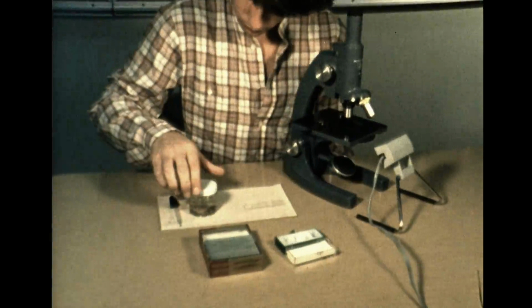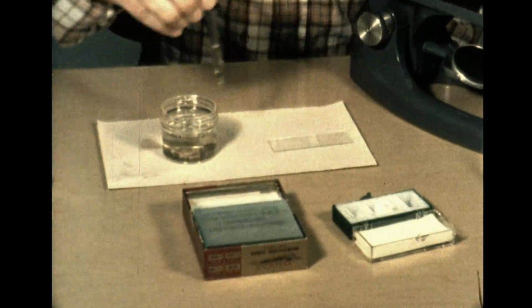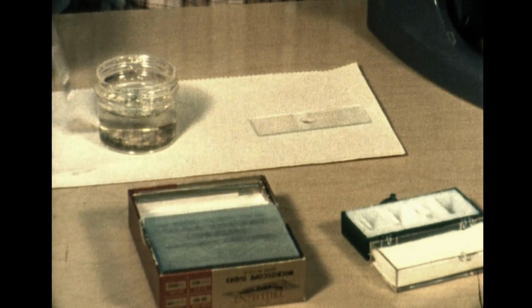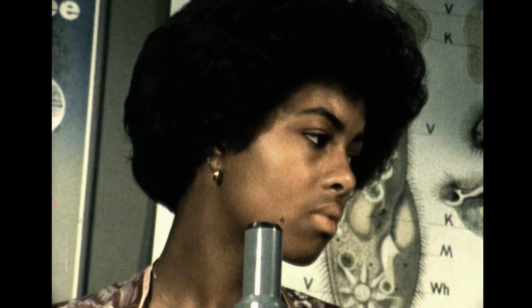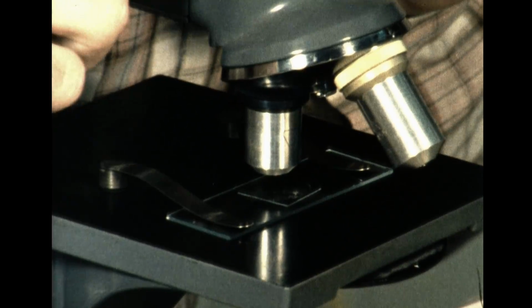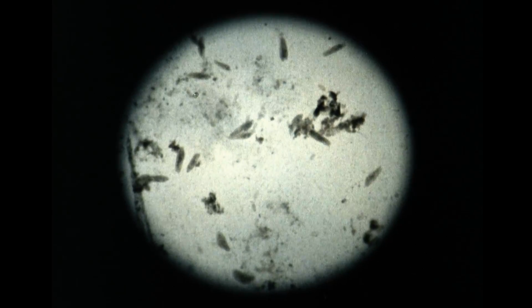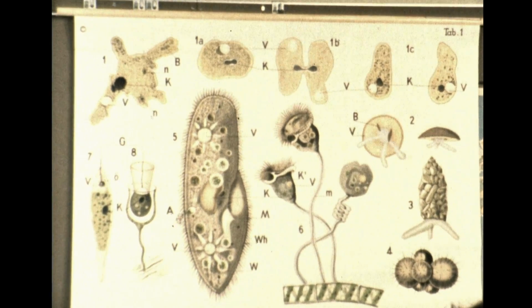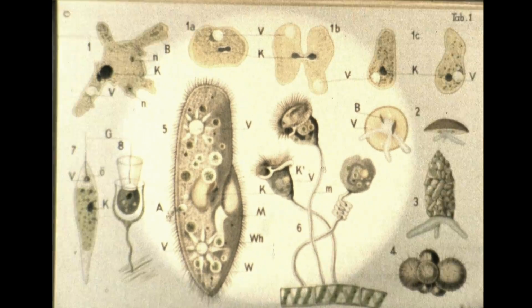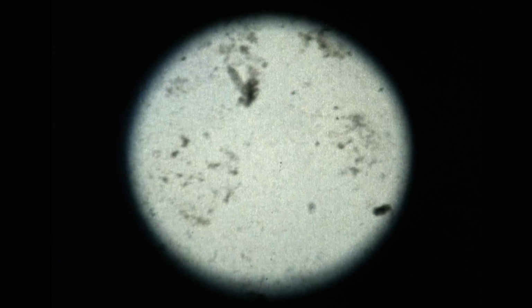This is water from a pond. It contains millions of living things and other substances, not visible to the unaided eye. The little drop of water squeezed between the slide and cover slip is the universe for these incredibly small plants and animals. Charts make it possible to identify some of the inhabitants of this drop of water. It is the microscope that is your passport to this mini world and countless other places your imagination invites you to visit.